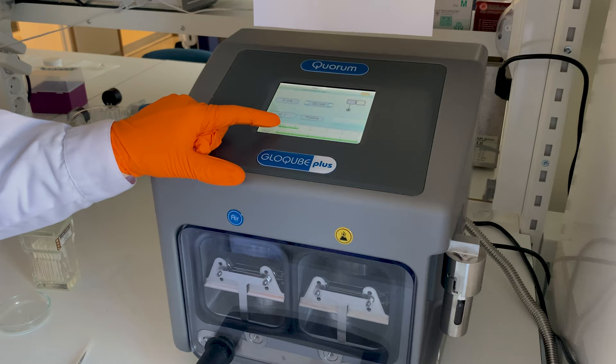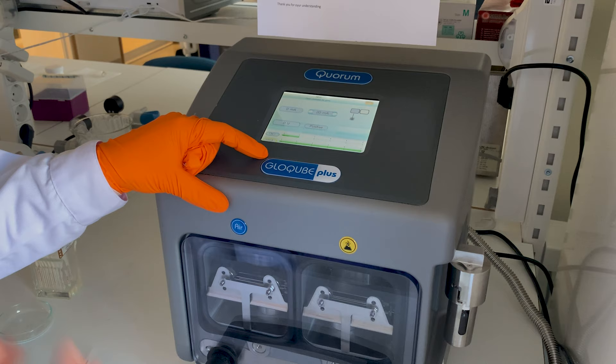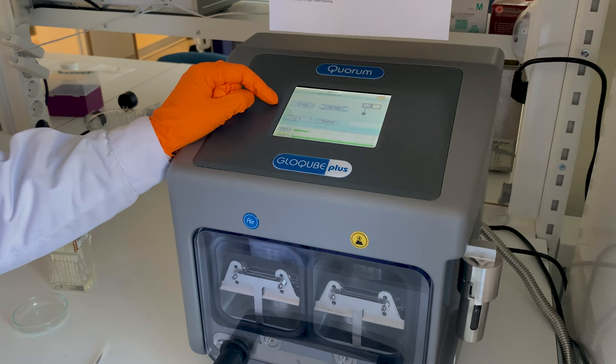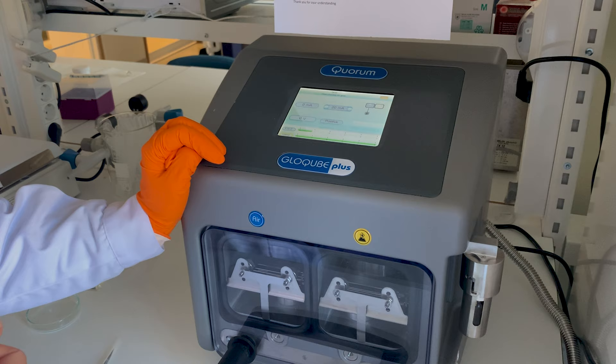We can see how the vacuum inside the machine is improving — we want to pump out air from the chamber first, and then in a controlled way allow some air into the chamber again, creating a plasma. It's the plasma that modifies the properties of the support film. The requested current is 20 milliamps and the measured current is currently 0 milliamps. It's good to keep an eye on that in case anything weird happens and to be sure that the program runs as it should.